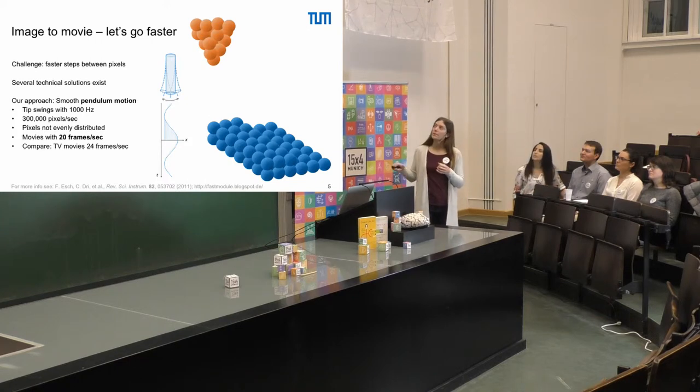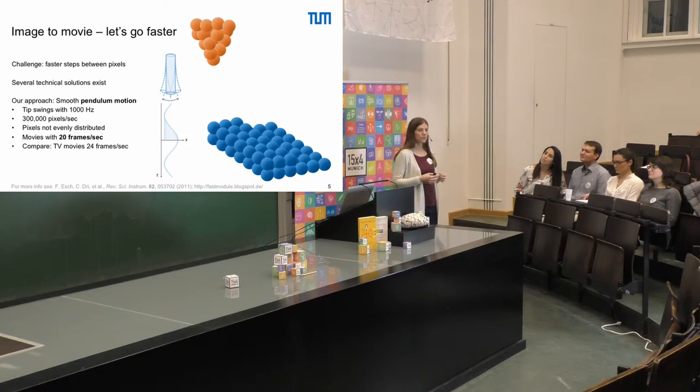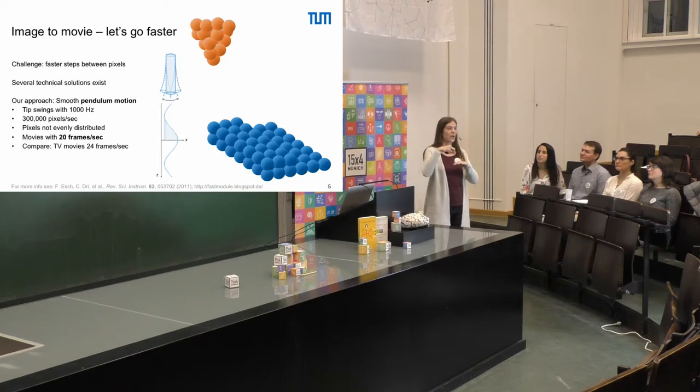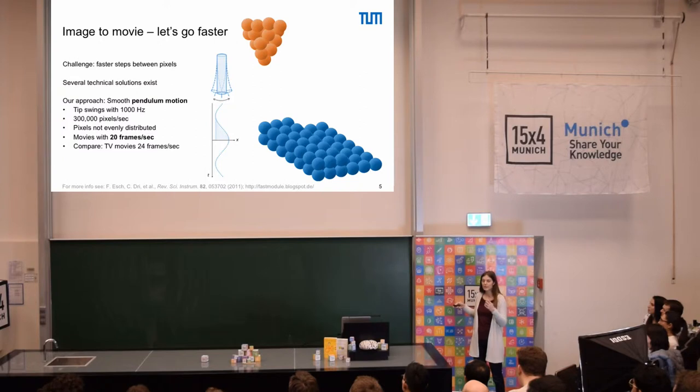This is a method that might sound quite hard with all these requirements, but it was actually developed at the beginning of the 80s by scientists in Switzerland, and they received the Nobel Prize just a few years later, because it was really a groundbreaking discovery that by just making this very fine motor we can really monitor things on surfaces very easily. What comes out is an image like this. In practice we don't do what I showed in this animation, we don't move one pixel per atom. We need to have more pixels per atom, because otherwise we wouldn't get a very nice image. And if we do that here, we have bright blobs, where every bright blob is one atom, and we see the arrangement of atoms in a metal surface.